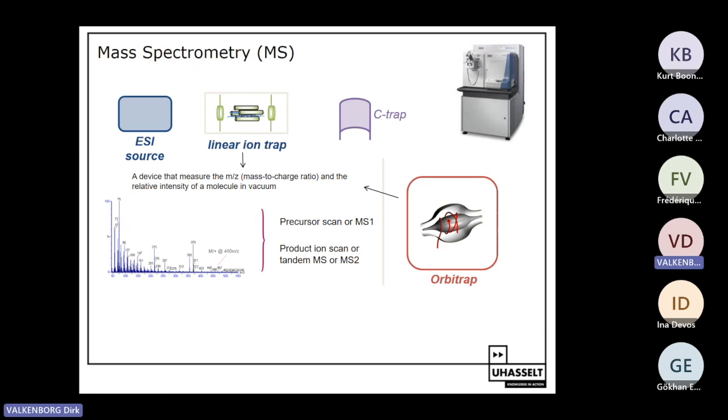So very important, because otherwise our molecules would collide with all types of atoms, and they will heat up and they will break apart. And we don't want that. Well, we don't want that at this stage in the measurement, but at some point we will do this on purpose. So let's have a look first how we will measure in the vacuum.